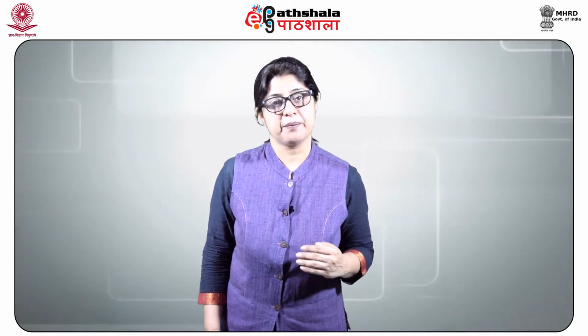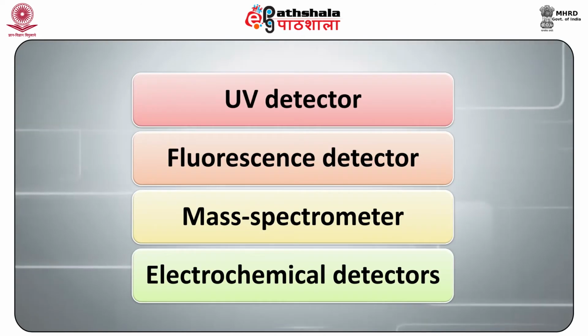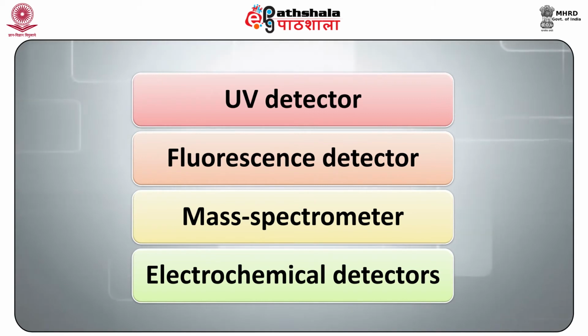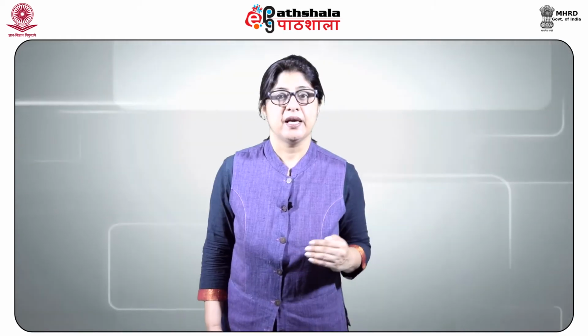Detector. Since the quantity of material applied to the column is very small, it is imperative that the sensitivity of the detector system is high. Commonly used detectors are UV detector, fluorescent detector, mass spectrometer and electrochemical detectors.